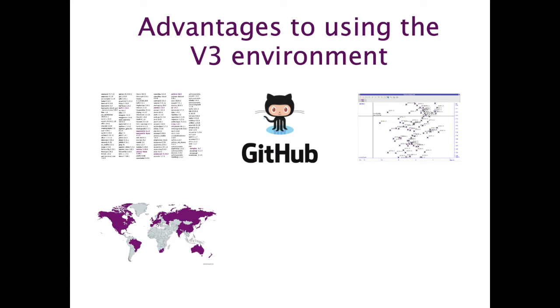So hopefully you'd be making life easier for your users, but it also means that in one go you've got access to a whole load of users who can very easily get a hold of your software and then start using it, and let's not forget, start citing it as well.